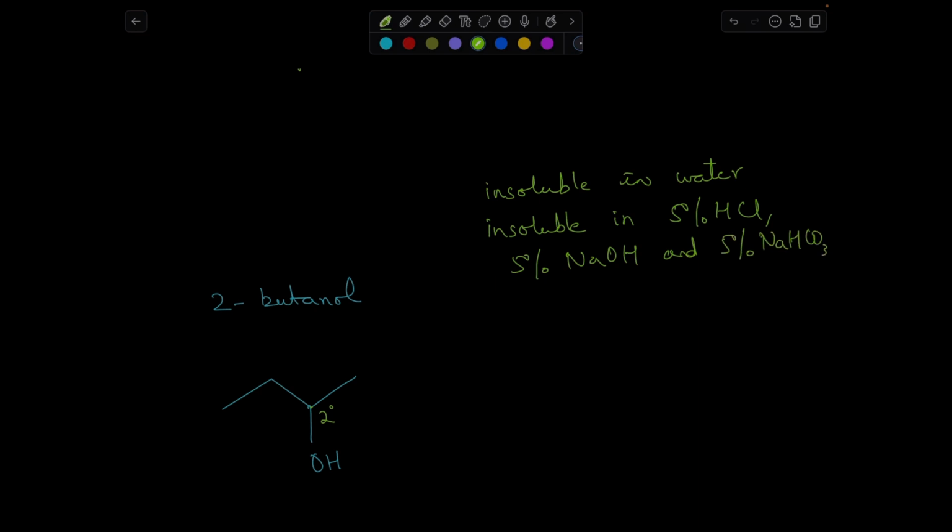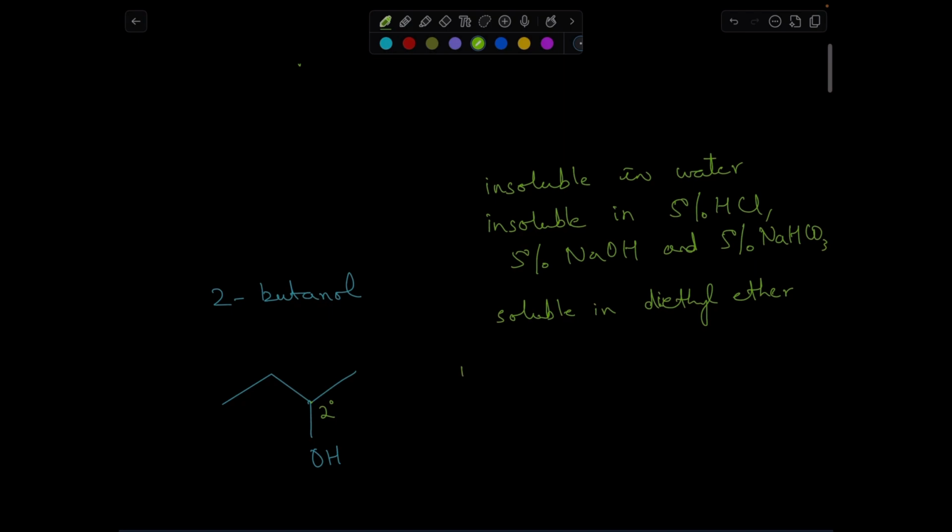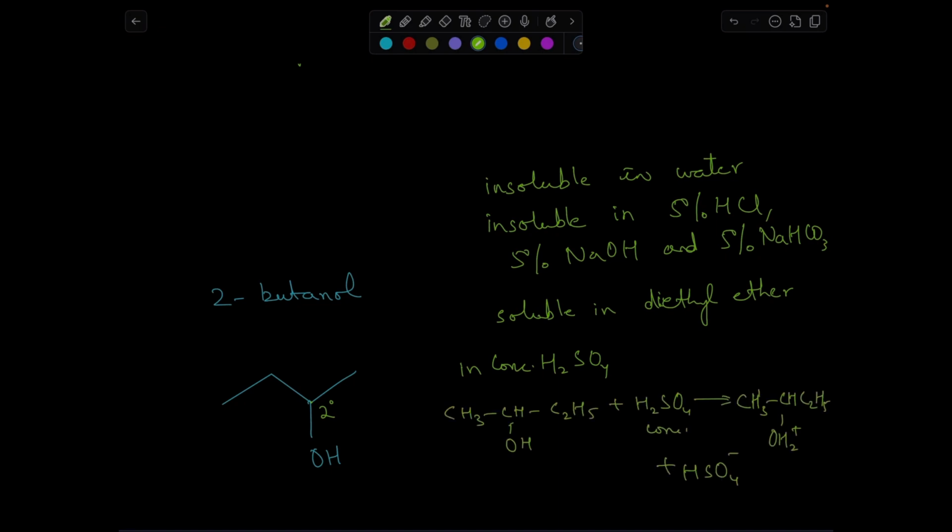However, the hydrophobic nature of the alkyl groups here makes it soluble in diethyl ether. In concentrated sulfuric acid, 2-butanol can get protonated, so we can say it is soluble in concentrated sulfuric acid.